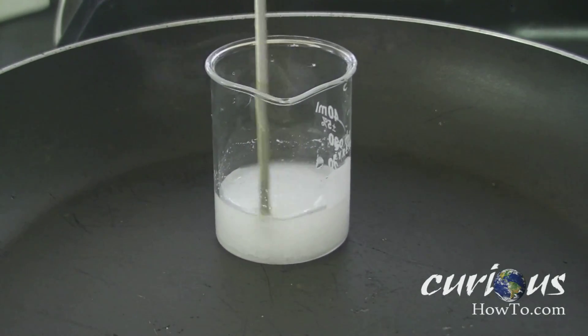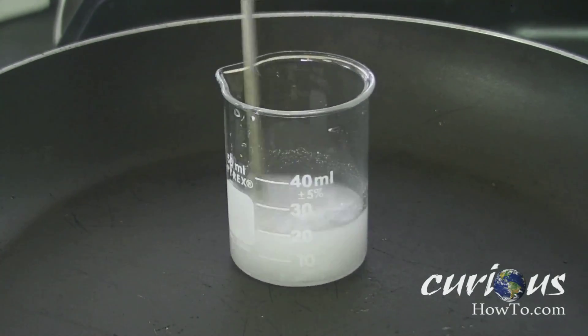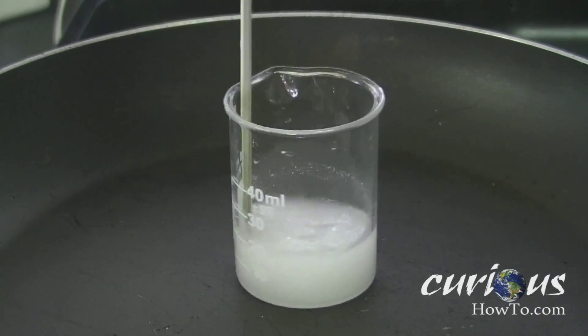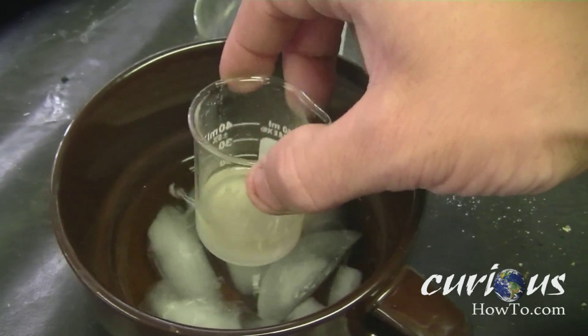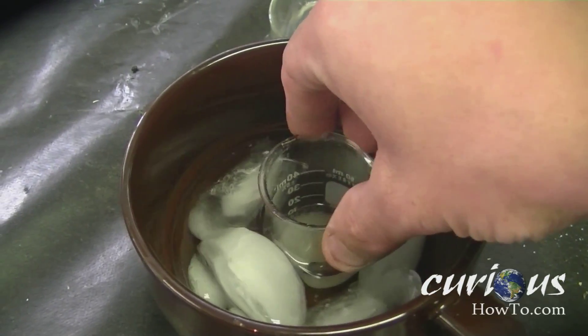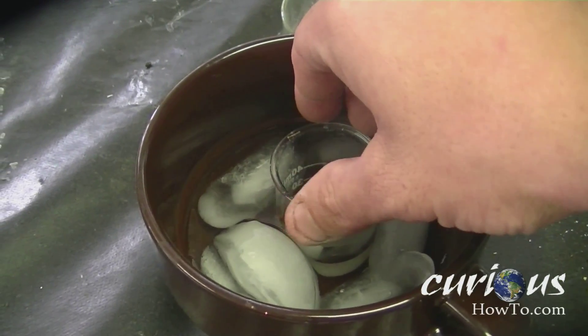You want to mix that up real good with a stir stick, and then you're going to want to start heating the solution up. Heat the solution up for a little while until most of the crystals have dissipated and are gone, and then set your solution to the side for cooling. You just want to let it cool normally at first until room temperature.